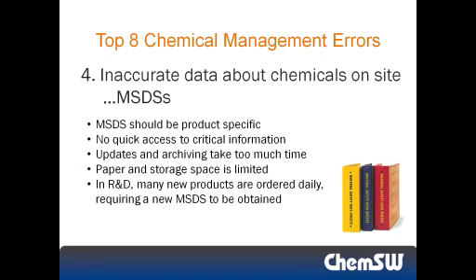Paper MSDS stored in binders. In this day and age, no electronic storage. I was at a university a while back on another tour, and we happened to be walking through a basement corridor on our way to the next lab when something caught my eye. It was rows and rows of old style cabinets with MSDS labeled on the outside of them.